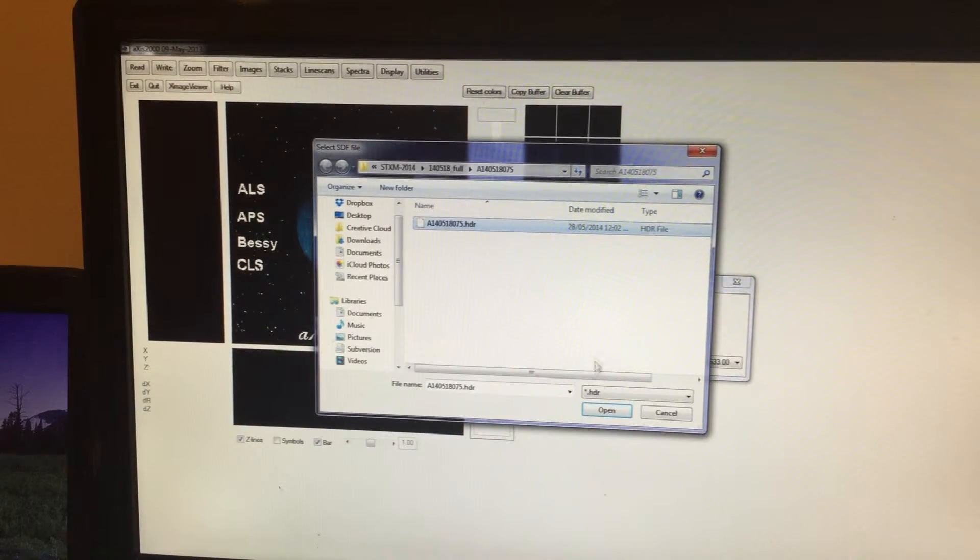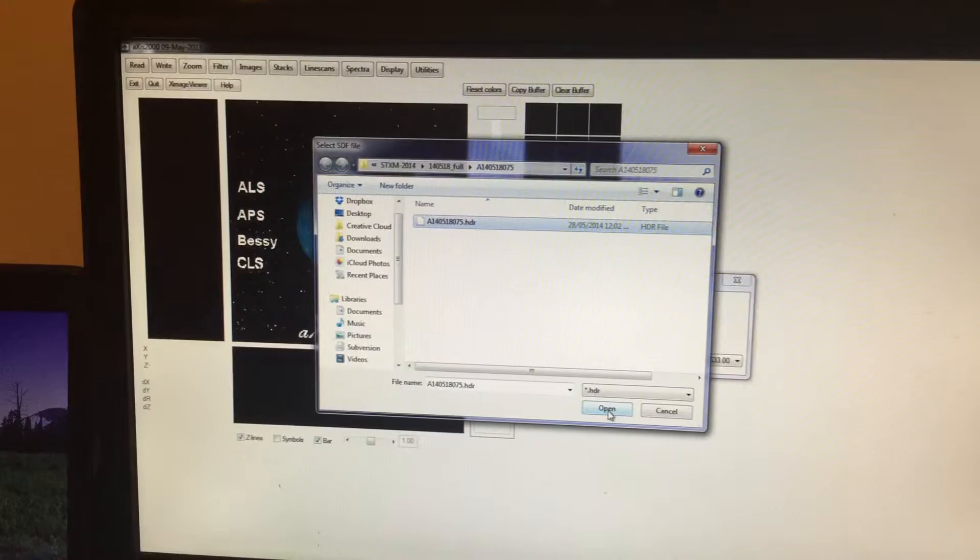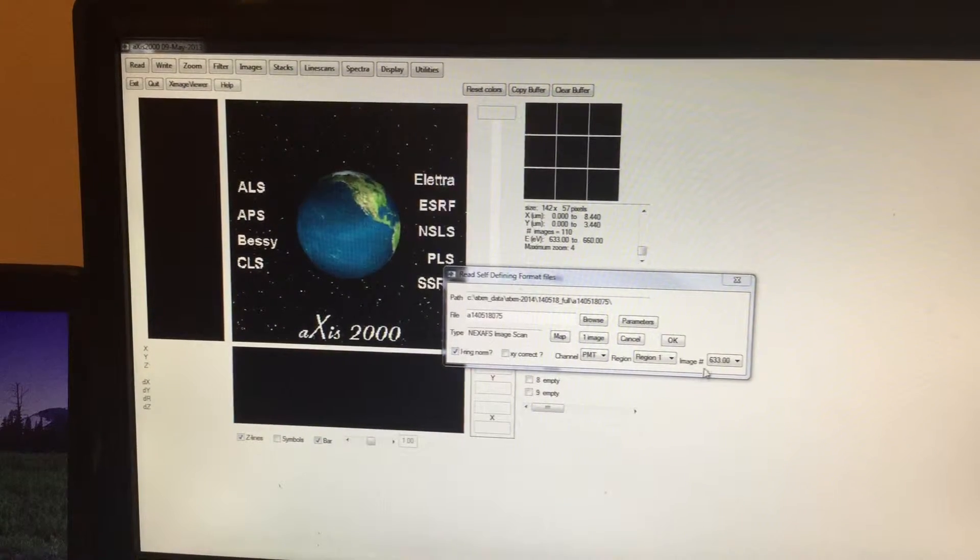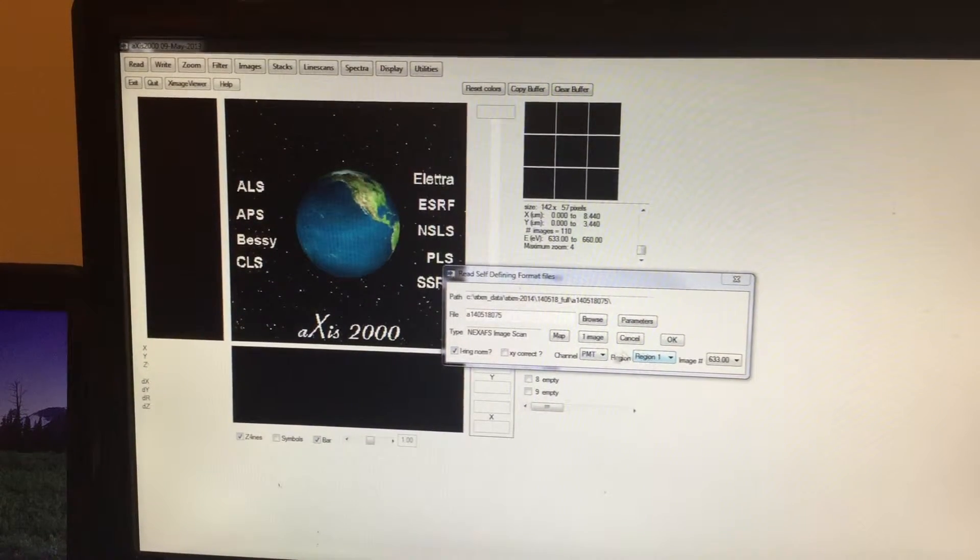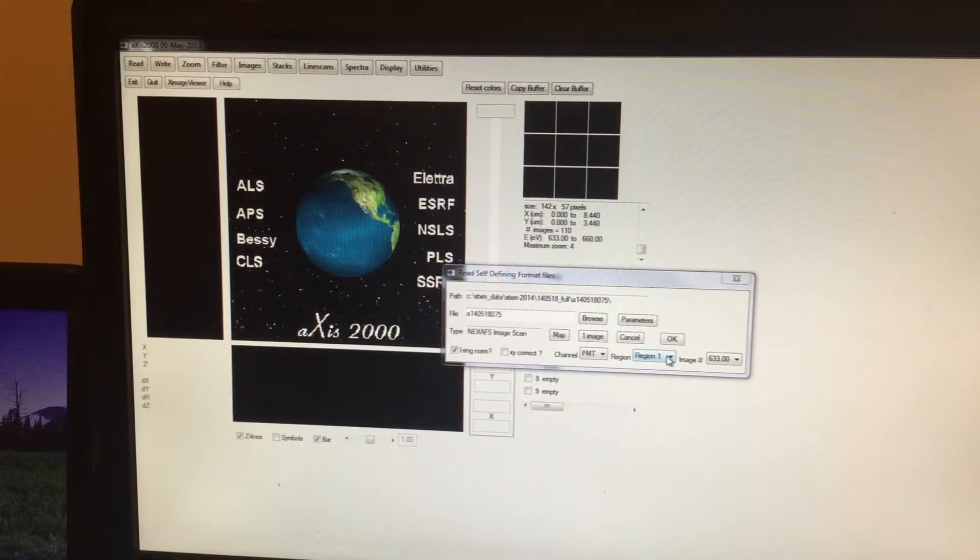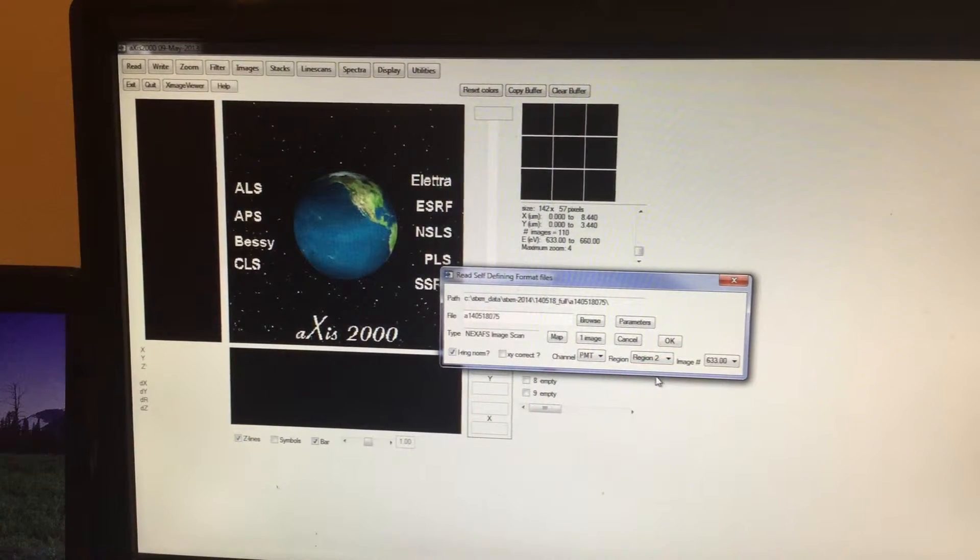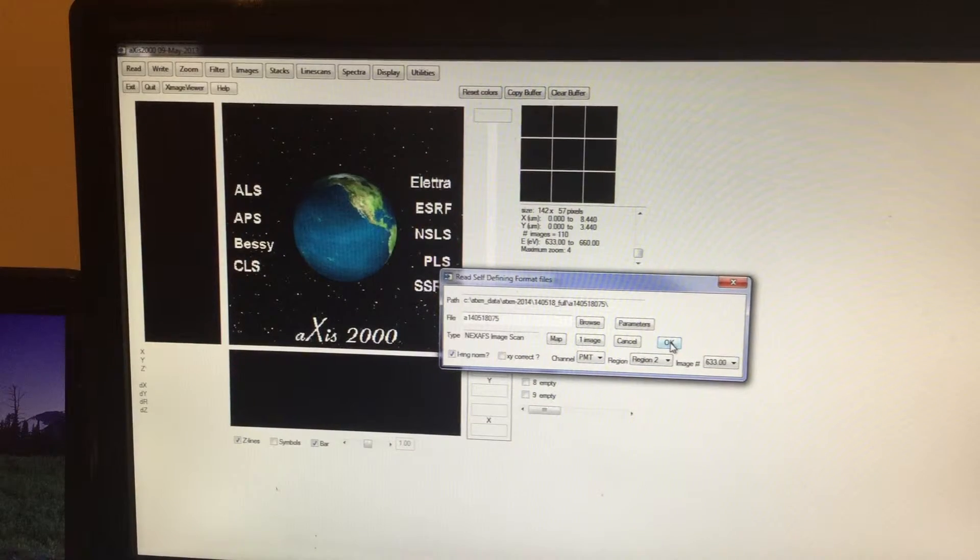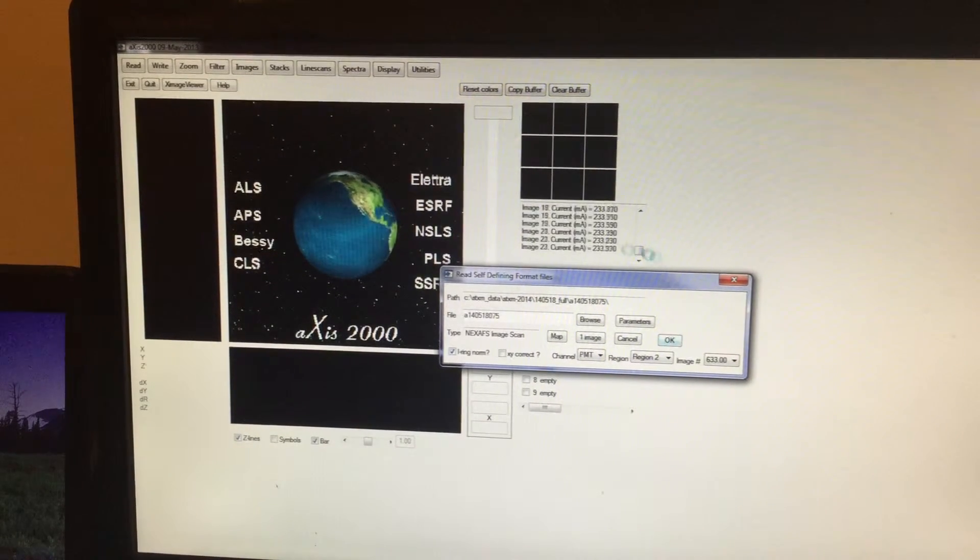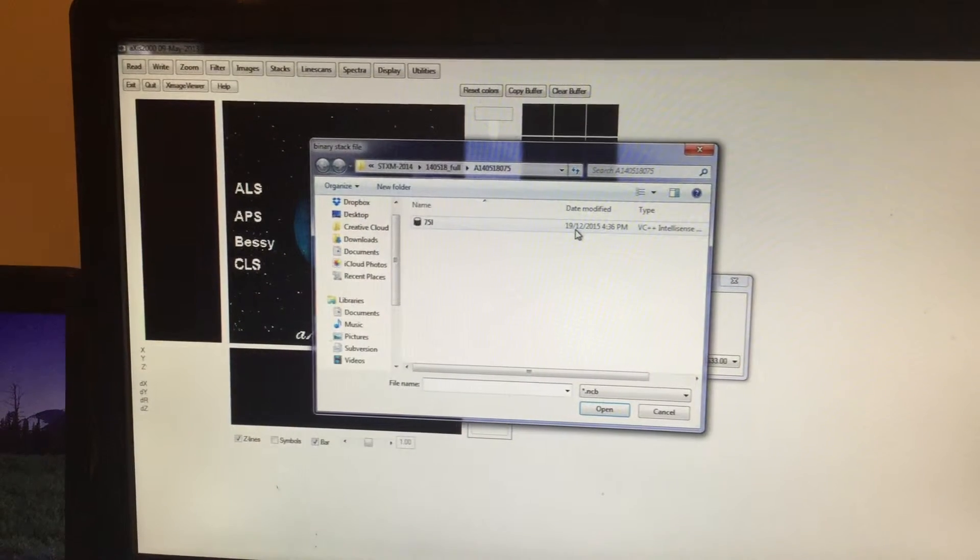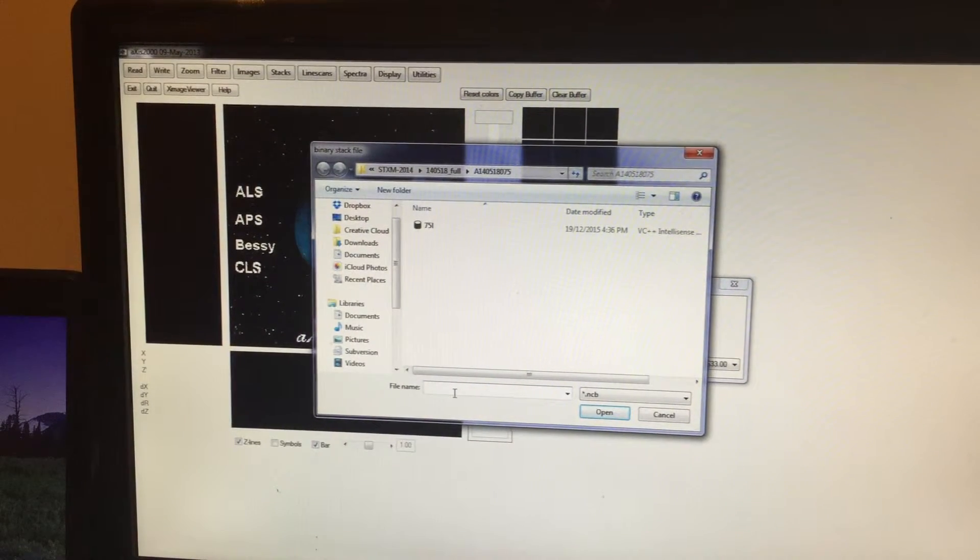Click on this stack file, then press Open. But here make sure that you click on Region 2, which corresponds to RCP, then press OK. Now you can see the data is loading here. Now this window will pop up.